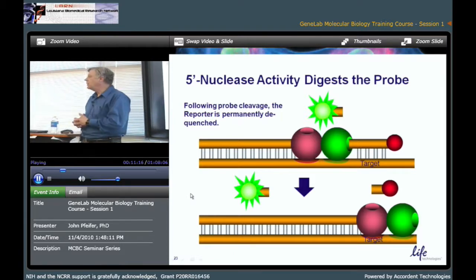As you might guess from the drawing, Taq degrades the rest of the probe until we have a second little fragment containing the quencher that also dissociates and floats about. So the two little fragments of the probe will no longer participate in the PCR process, but they'll act as permanent records of amplification.